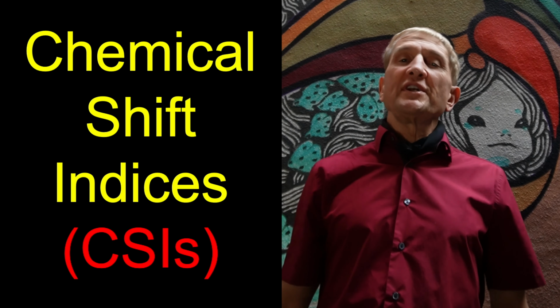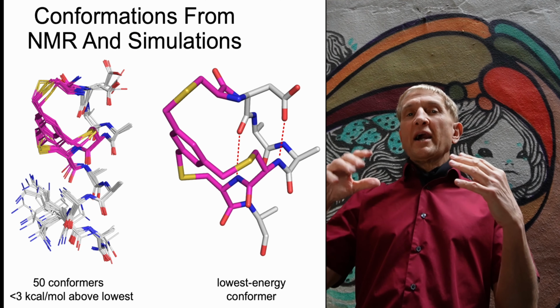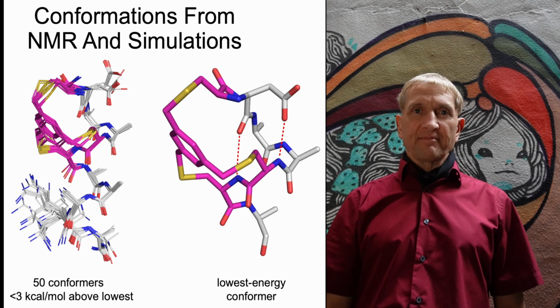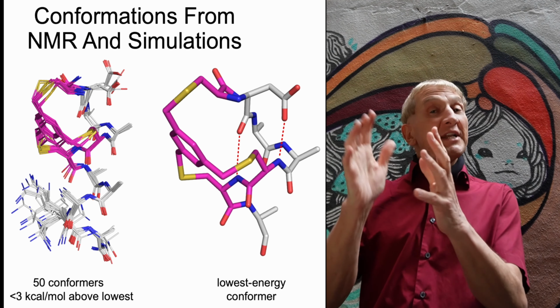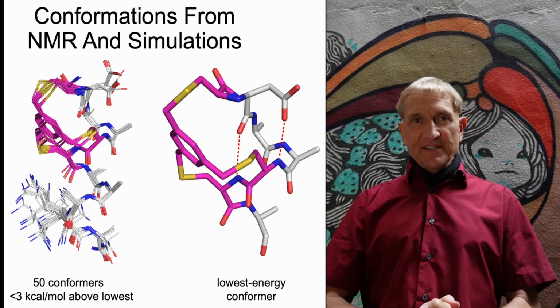We were in a position recently where we wanted to accumulate all the evidence we could for a peptide mimetic being either helical or not in solution. We did 2D NMR, we looked for cross-peaks, we did chemical exchange, we did CD. But in addition to that, there's a very easy test.